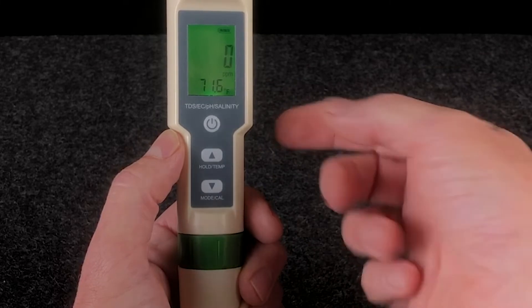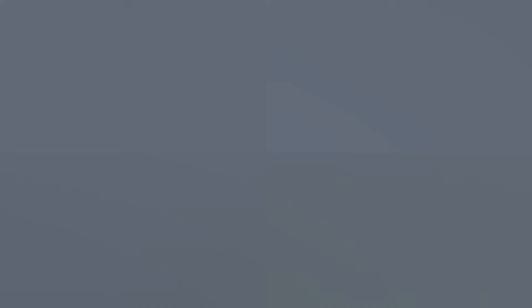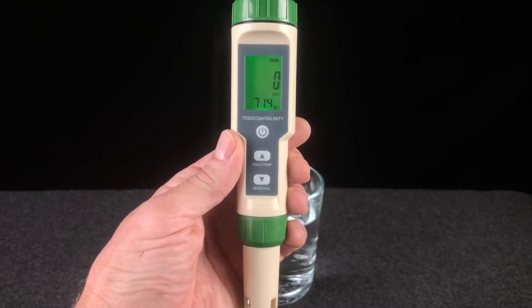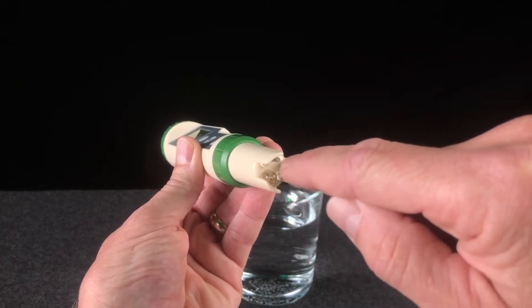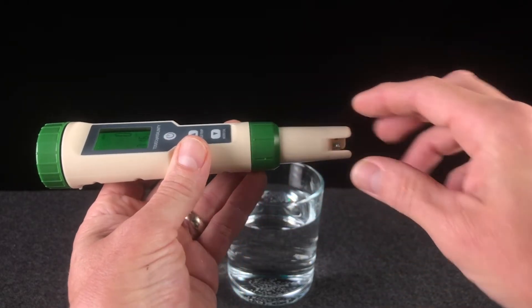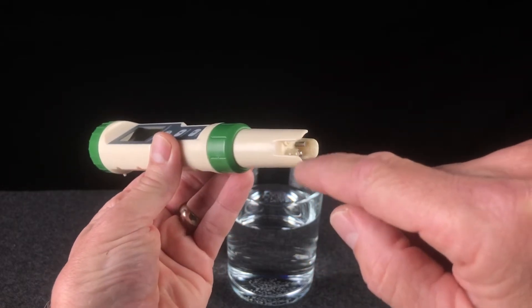To turn off the meter, simply press the power button once. Before we dip the meter, I just want to show you one thing. On the bottom of the meter are all of the sensors that are used by the meter. So when you dip the probe, you really only need to dip the probe about halfway — that's more than enough to cover all of those sensors.